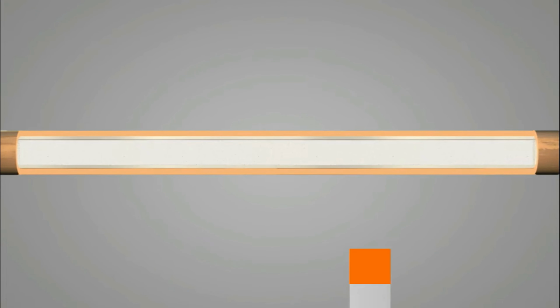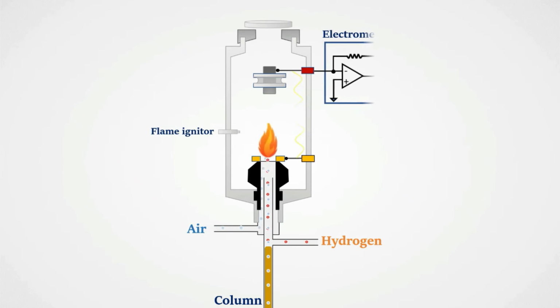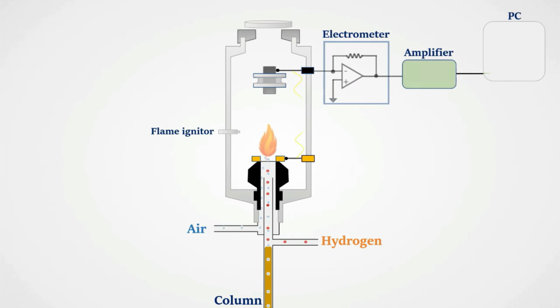As we have seen earlier, the green would elute fast because it has lesser interaction with the column, followed by the blue and the red or the yellow at the very last stage because it has a greater interaction with the stationary phase. So this gives us the idea about different polarity or different retention of the analytes with the column. So this is the overall instrumentation and working principle of gas chromatography.